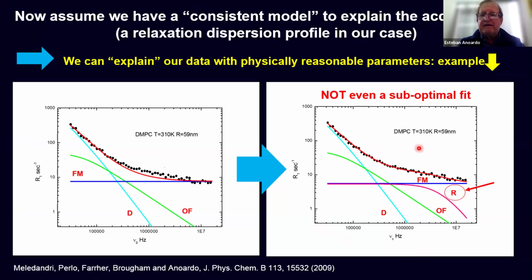There is no fitting, not even a suboptimal fitting. This is just testing: putting in the parameters, you get information, then you touch a little bit, and you get a result. And what is important is that all these physical parameters can only lie in a given range. It's not possible to have a diffusion that may take any value, because you may get a very nice verification of your model, but with senseless parameters, which often happens with fittings somehow.